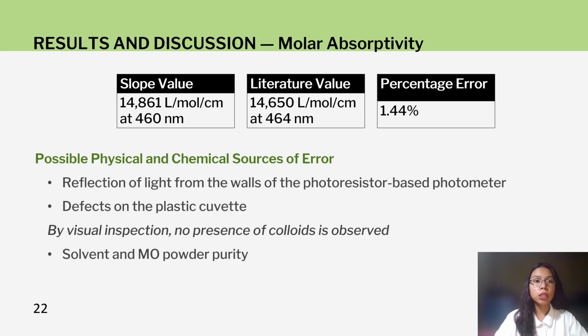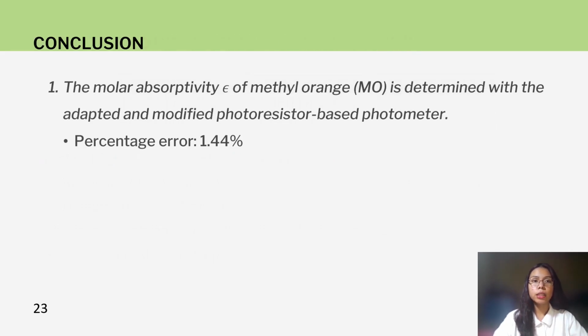The physical factors that may contribute to the error are the reflection of light from the inner walls of the device and the defects on the plastic cuvette. Visual inspection showed that there is no presence of colloids or suspensions. However, the effects of MO powder and solvent purity in the achievement of the exact molar absorptivity value are noteworthy. The extent of these physical and chemical factors that may have contributed to the sources of error were not explored in this study.